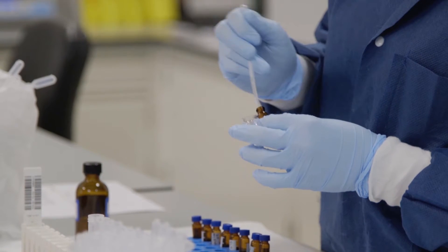I'm Jennifer Jones. I work here at LabSource in Greenville, South Carolina. We're primarily a toxicology lab.